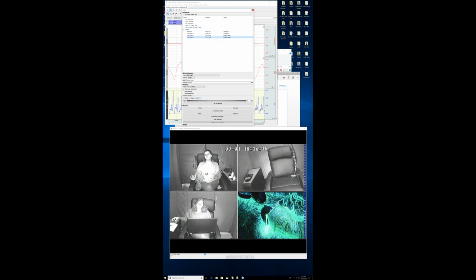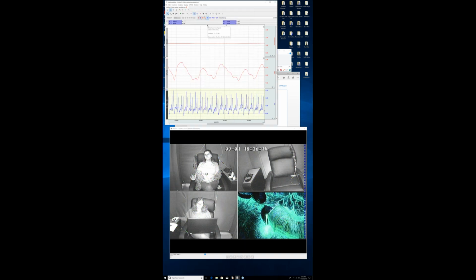Yeah, the timestamp is there, and then also, if I just close this out, you can export all of this information as well. And if I mouse over here, it gives me that information as well. So this is 17.17 seconds. It was a type 2. Subject looked away, and it gives me the date and time information as well. So hopefully that answered the question.